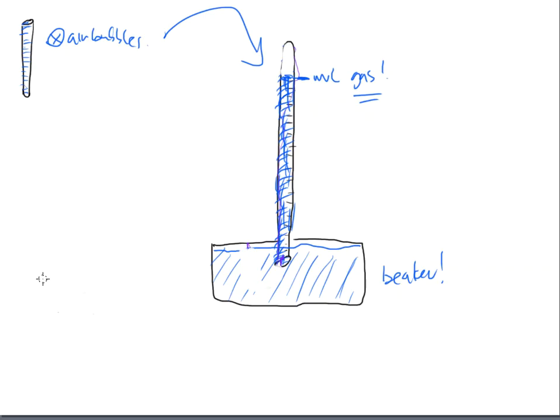And then what we do instead, and I'm going to draw a zoomed in piece for you, is that we take our eudiometer, and this is the end of our eudiometer right here. So this would be our opening. And then this is going to get submerged down into some water. So let me be a little creative and at least put blue here for water or whatever.